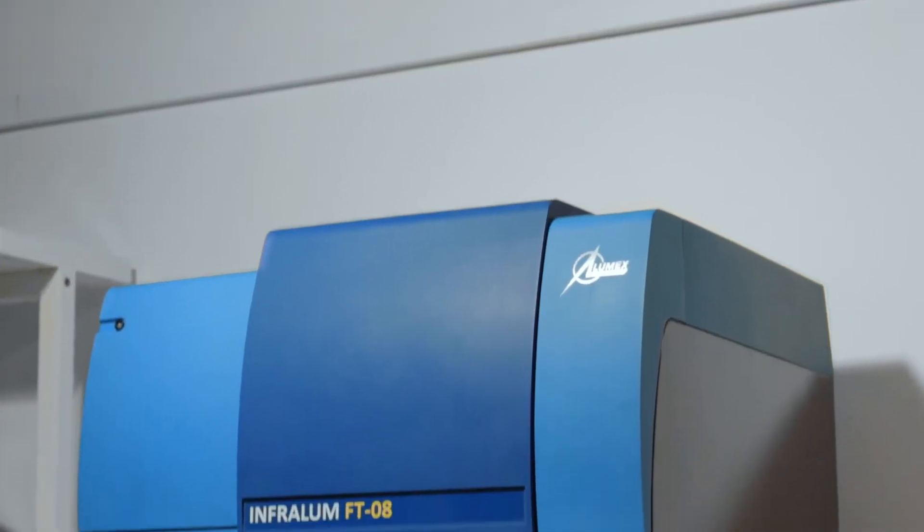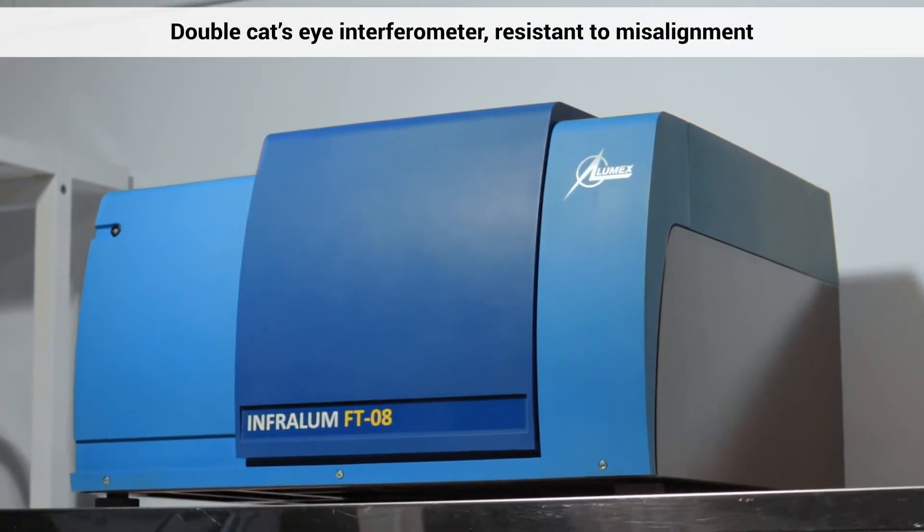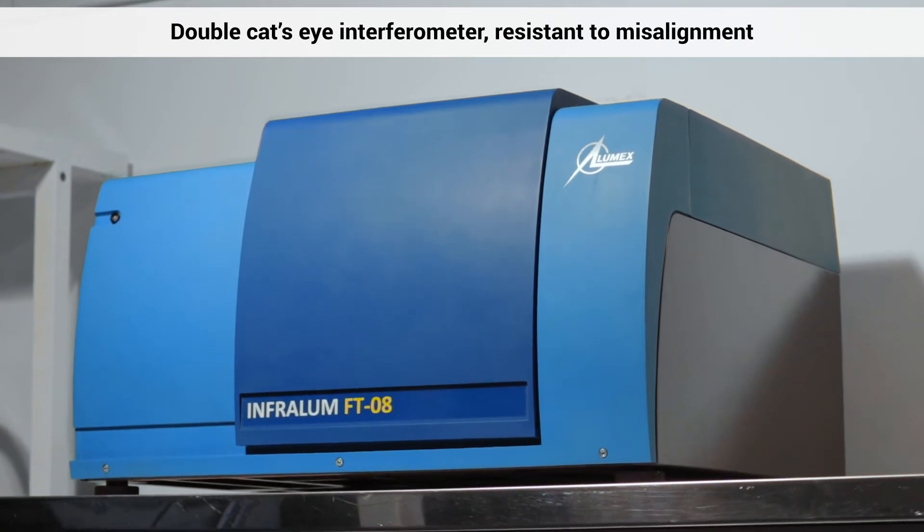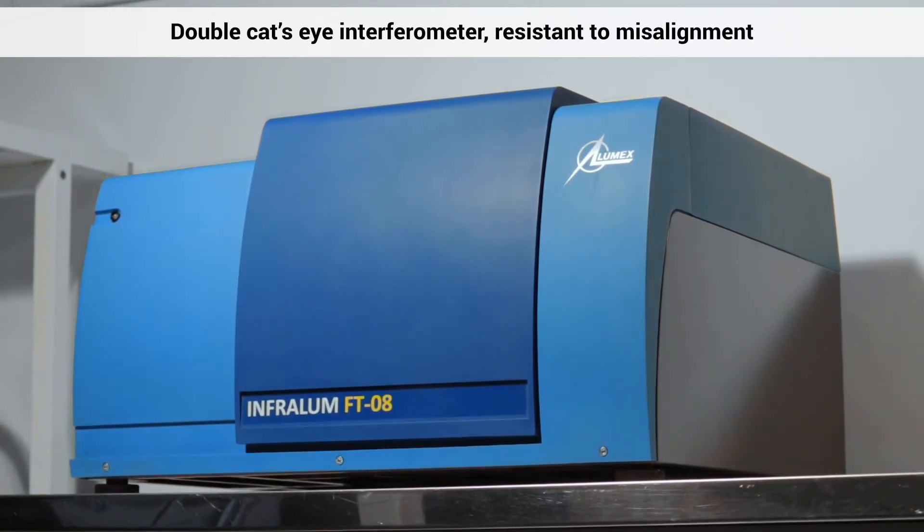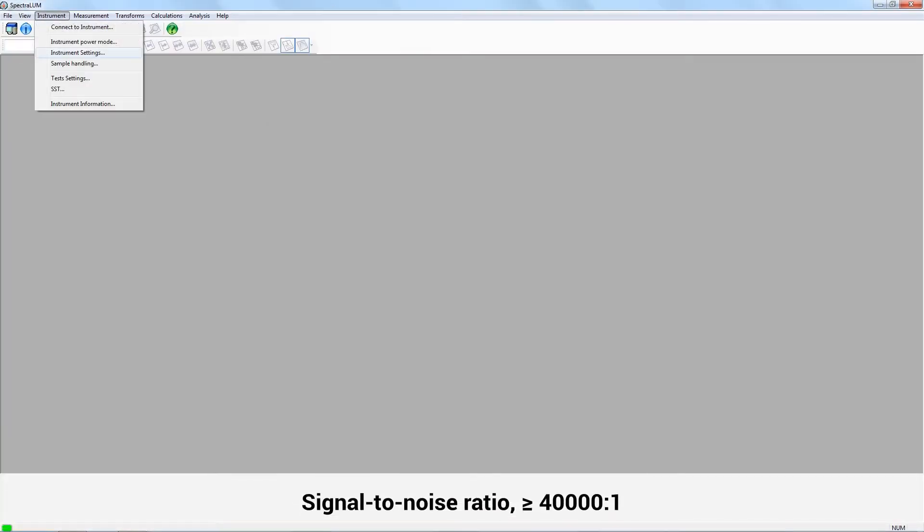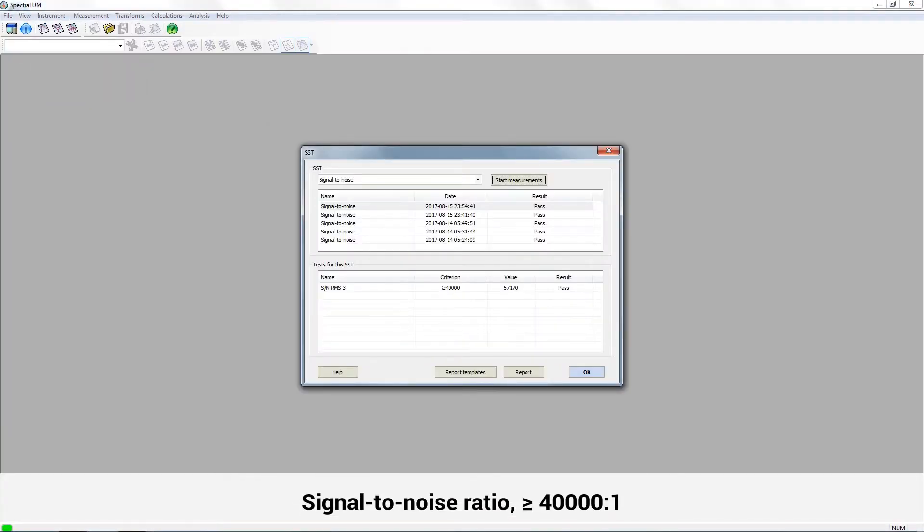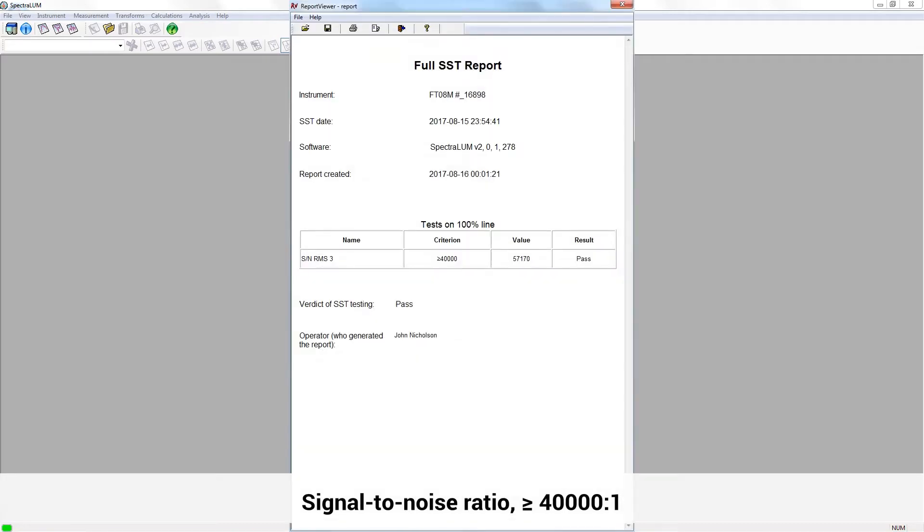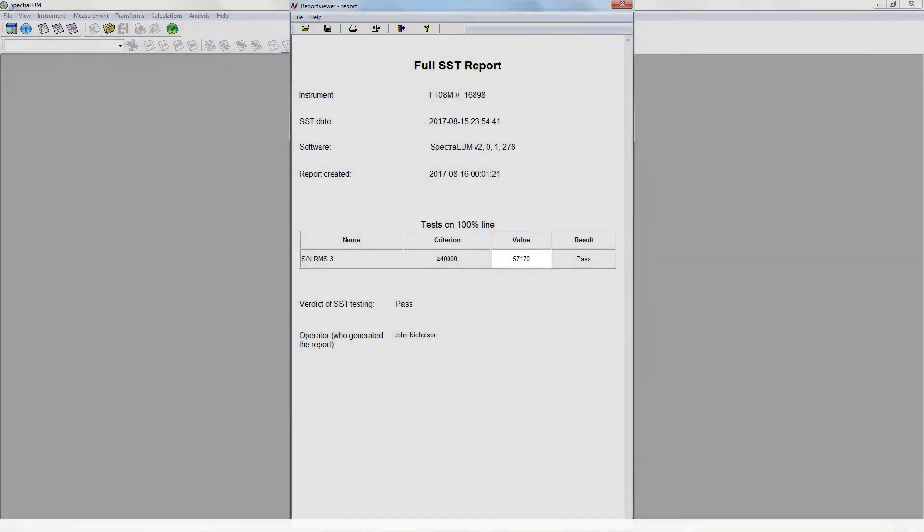It also comes with a number of technical advantages. Firstly, it has a patented interferometer, which makes the optical system misalignment-proof. Secondly, the high signal-to-noise ratio, over 40,000 to 1, allows users to obtain high-quality spectra without loss of information.